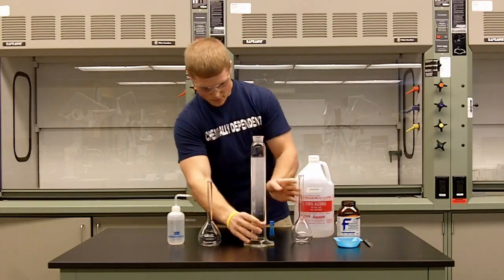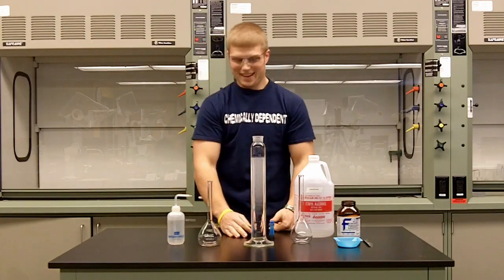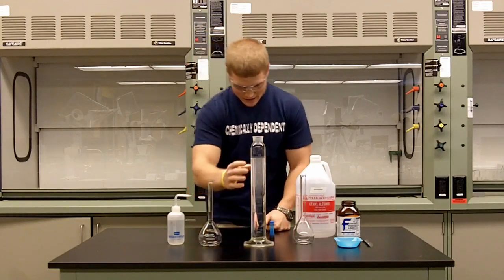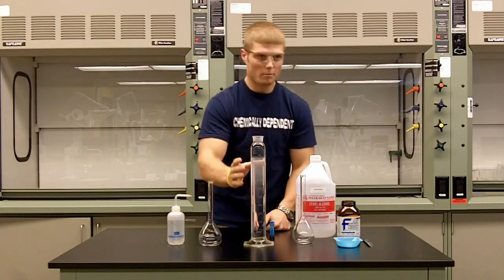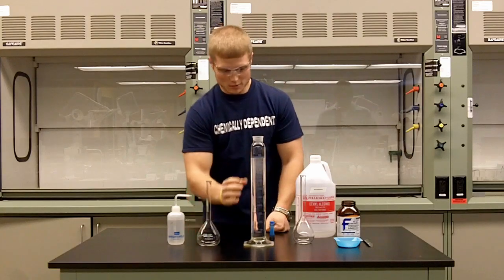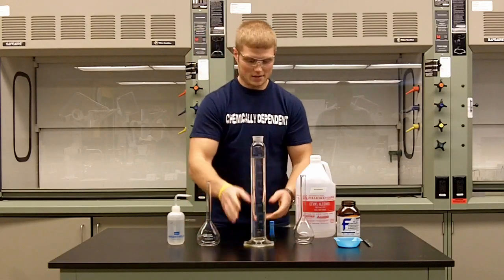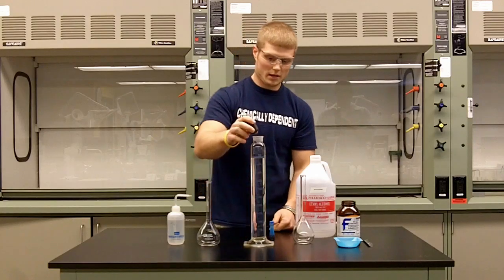Let that settle, and as you can see, we put in exactly 500 milliliters. As the two mix together — because they are completely miscible liquids — the volume will actually decrease, and that's due to the water and ethanol mixing.